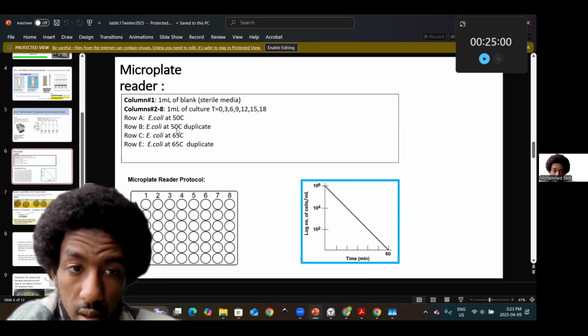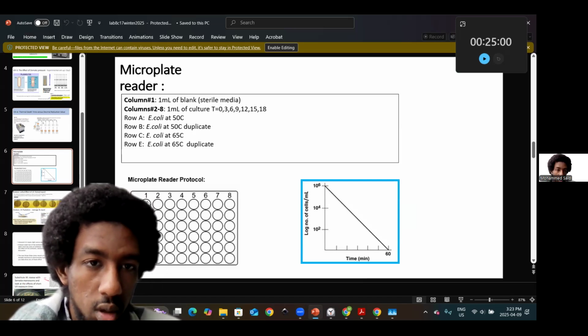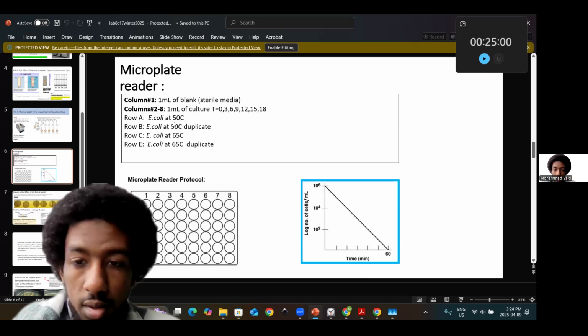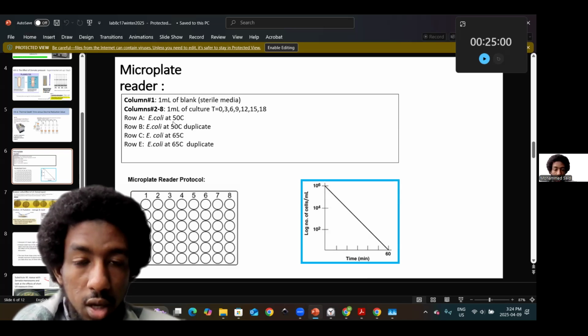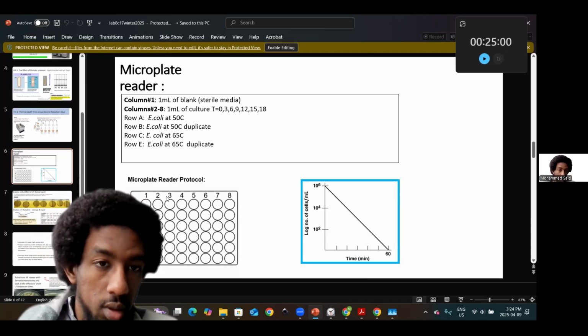If it's non-sterile, like if it was contaminated, then we expect a difference in absorbance readings thereafter. But nonetheless, that's post-incubation. Because even though this incubation goes up in time, you're primarily focusing on what you see in this microplate reader for a single time point.